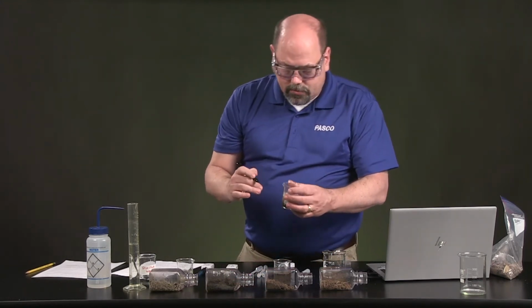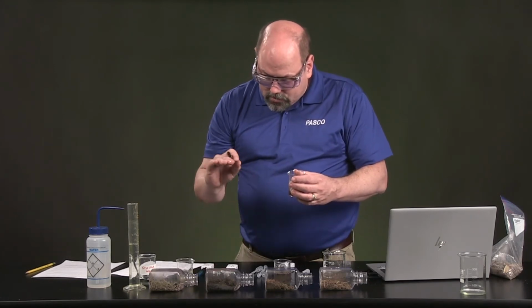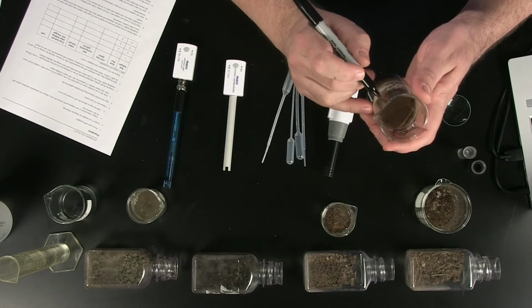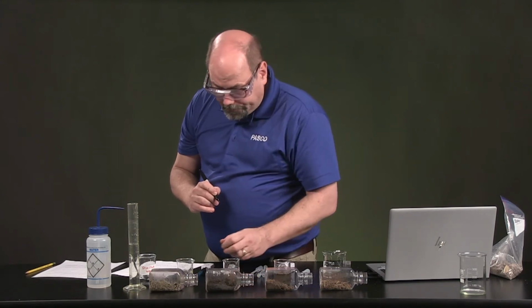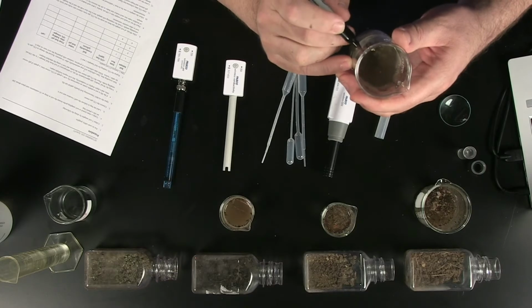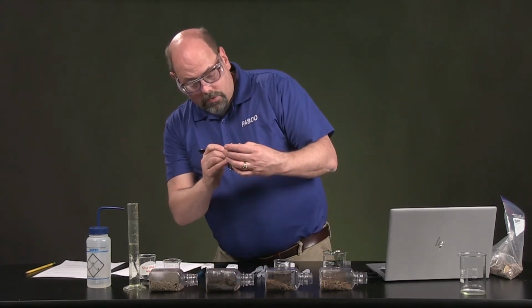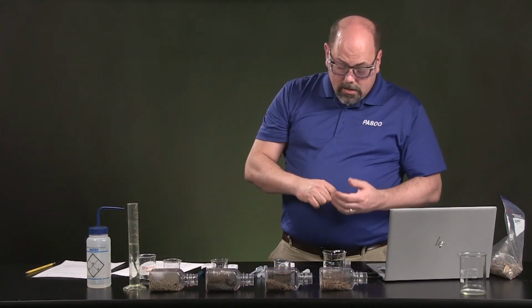Didn't have much for grass, just open dirt. A few little things were growing. In the garden area, the garden soil, it did have a fine sort of a moss that was growing in there. So this was the garden. And I believe at one point we started off probably with peat moss or something from a store to start those plants growing. Last one came from the creek, so it was a sandy creek right on the shores. And so that is sample 4. Let me make sure I put 3 on this one. Okay, so those are all labeled.